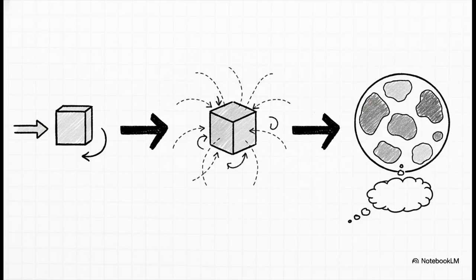But what if you need the whole picture? I mean, the full 3-dimensional story? Well, that's when you bring out the big gun, the pole figure. This isn't just one measurement from one angle.